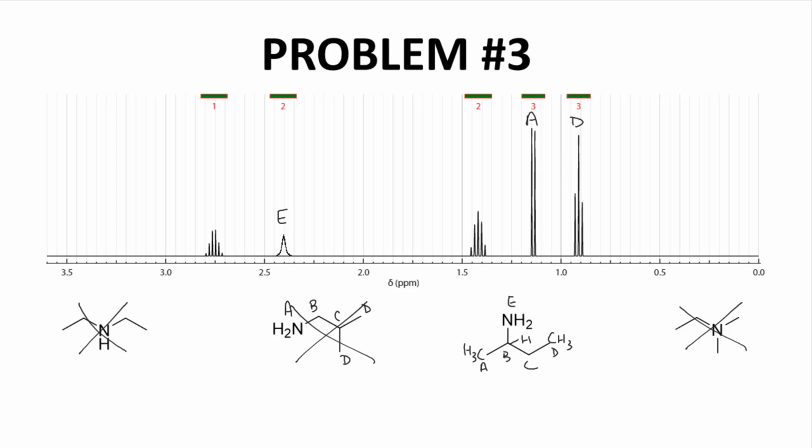Now let's go ahead and assign the rest of the spectrum. Peak A, we've already assigned that, so let's try peak B. Peak B, that's a hydrogen that has neighbors on A and C. That's 6 neighbors. I'm sorry, it's 5 neighbors. 2 on C, 3 on A. 5 plus 1 is 6. So we see this high multiplicity signal, and it is 1 hydrogen. That looks good. And then let's look at these 2 CHs. So they have 4 neighbors, and we see a multiplicity of 5 for that peak. And again, the integration works.